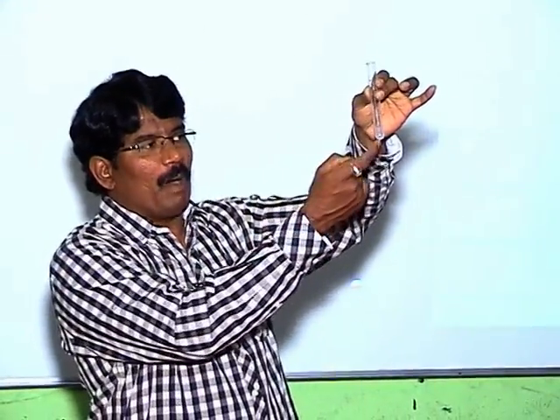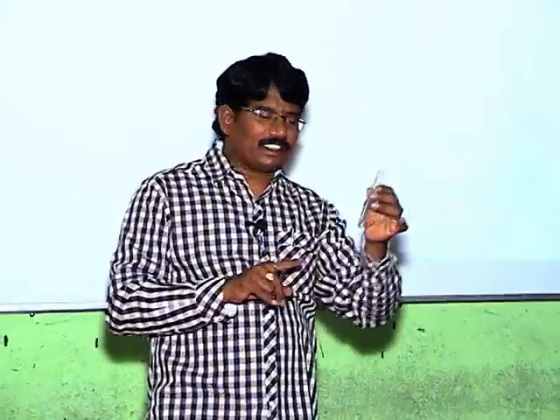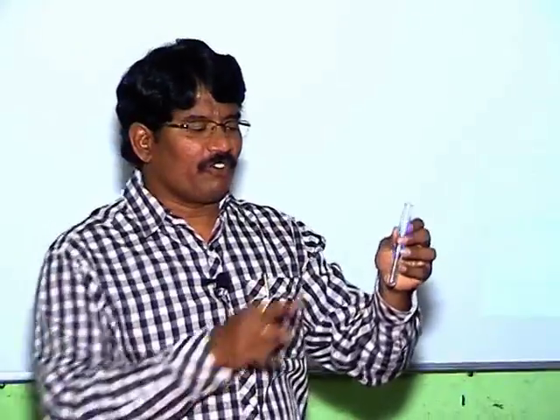Quick effervescence is nothing but the evolution of gas in the form of bubbles from the bottom of the container. If this quick effervescence is observed, we need to mention the same thing. In that experiment, first we need to mention what we are doing in the form of experiment, the second part is observation, third part is inference. In the experiment, a small quantity of the given salt is taken in a test tube and dilute HCl is added to that. That is the experiment part. Observation: quick effervescence is observed like this, and we need to mention this observation.